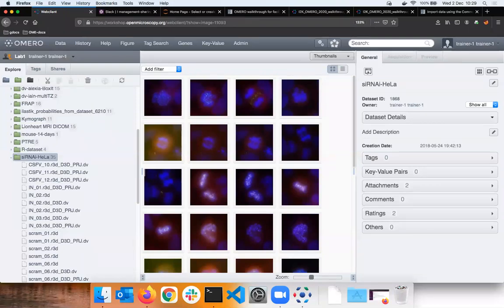If we have this type of in-place import element showing the only thing, I would say having them make a cron job shouldn't be a difficulty, a problem. The only thing is where to cache the credential for the person doing the import on their behalf, where they will have to hide in a configuration file, you know, my login or session ID or something like that, a persistent session ID that the script can connect with.